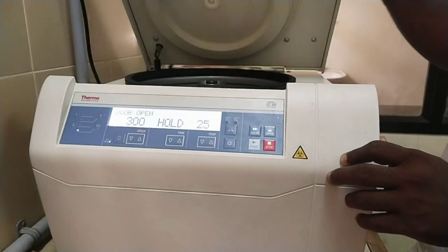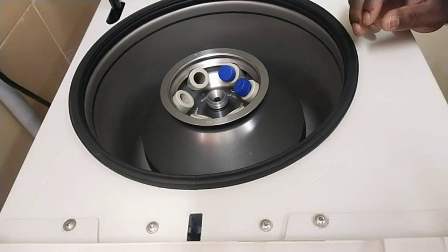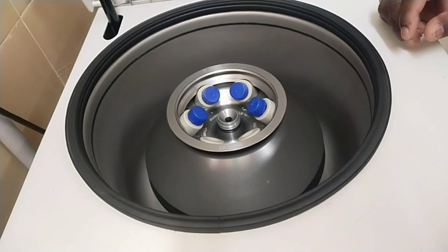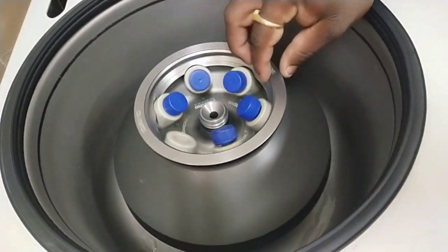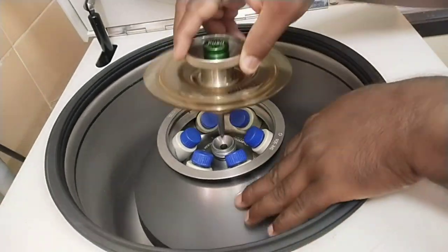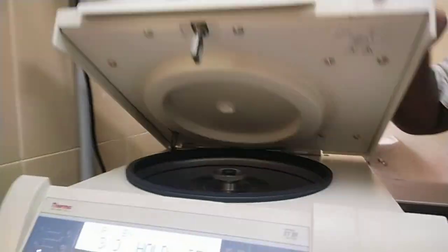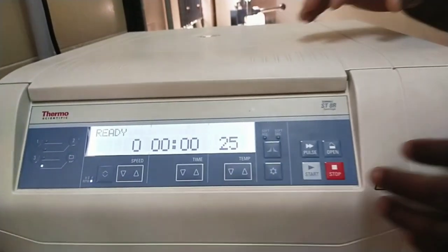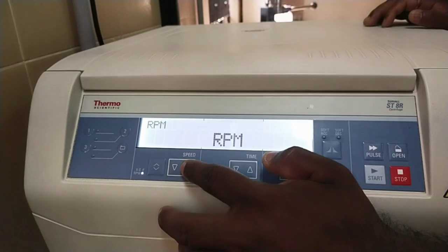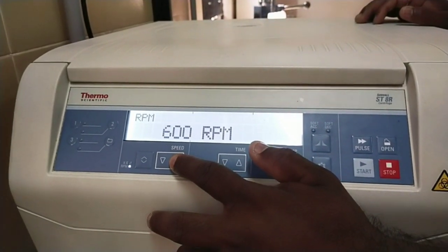Now place the centrifuge tubes or microtubes into the rotor. Close the lid and make sure the lid has a tight fit. You can observe how the centrifuge tubes or microtubes are placed. Now set the speed in RPM, time in minutes, and temperature in degrees centigrade.